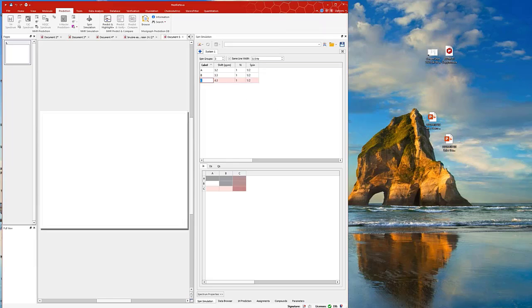Now I'm going to change this to X. Just click here, so it's going to be updated here as well. You have to click here to see that updated for J couplings. For the J coupling between A and B, I assume it's like methylene, so it's going to be big. Let's say it's 10 hertz. Between A and X, there's one that's a little big, like 8 hertz. And between B and X, maybe a little bit smaller. Let's say 3 hertz.